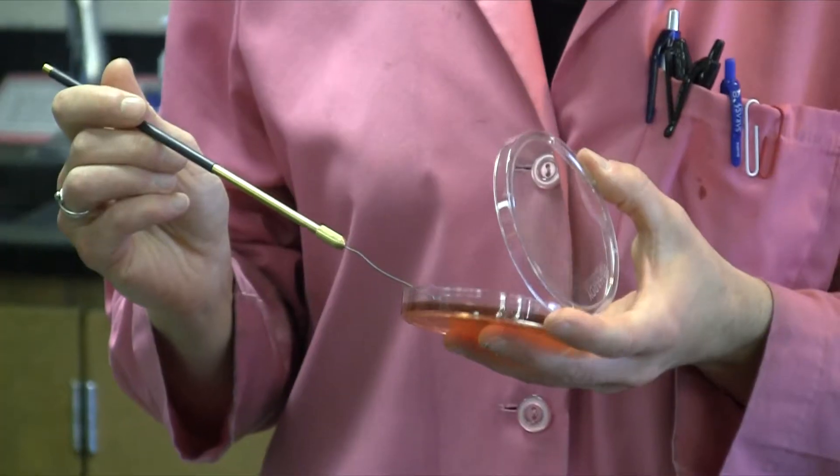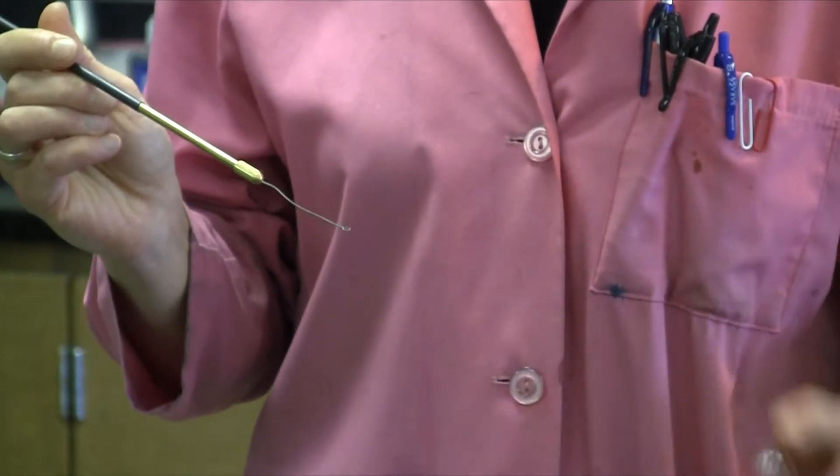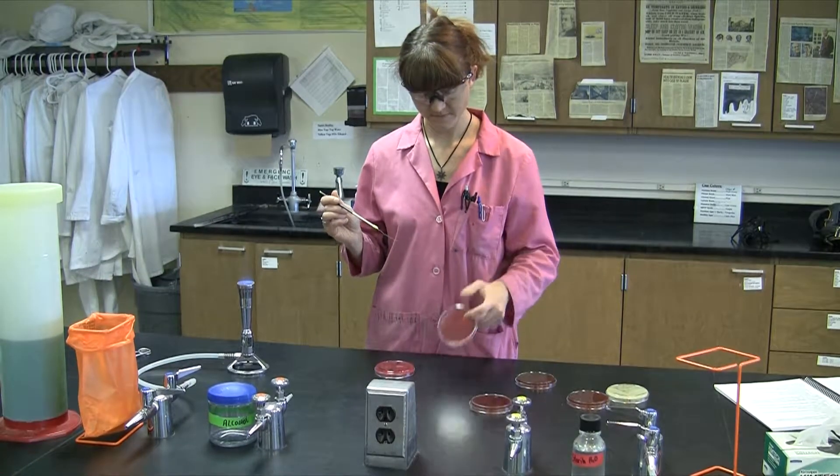Those bacteria that can also ferment the sugar mannitol will turn the sort of reddish color of the phenol red from red to yellow.